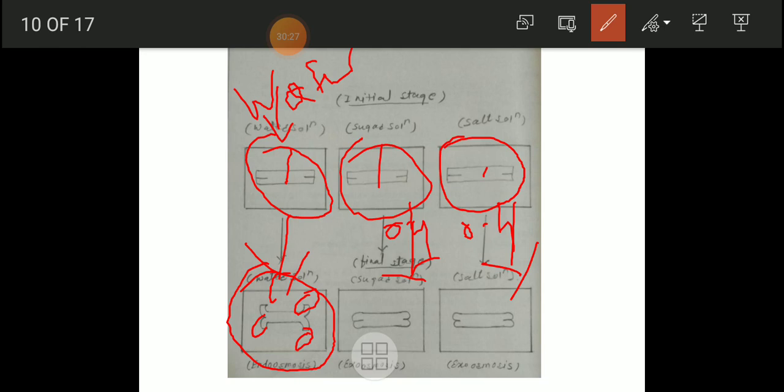Here, no change is there when we place arum pieces having slits into a 0.4 molar sugar solution and a 0.4 molar salt, NaCl, solution. There is no change in the sense the water present in the arum comes outside, that is exosmosis takes place. Because of that, no curling. So this curling experiment shows that curling is due to endosmosis and no curling is due to exosmosis. So this we have observed here.